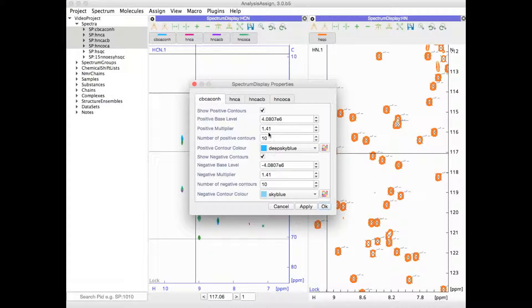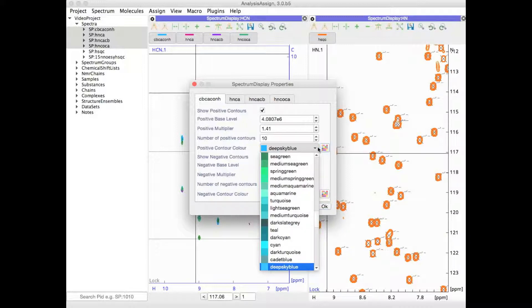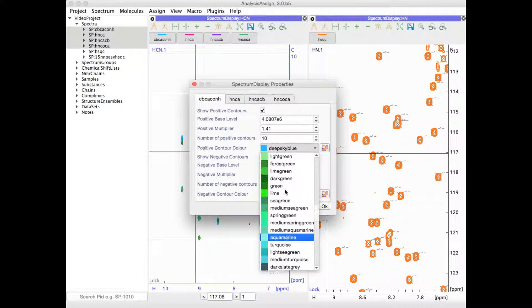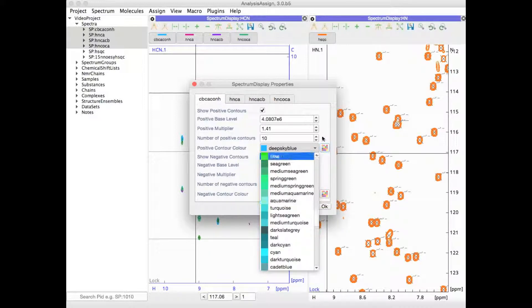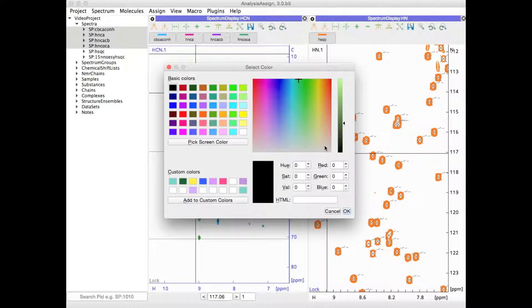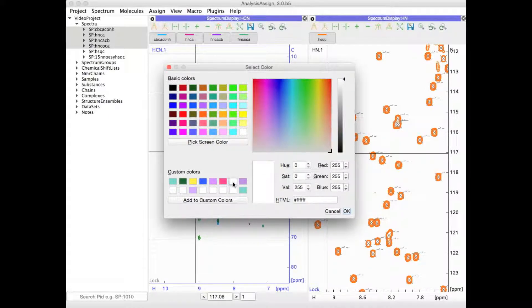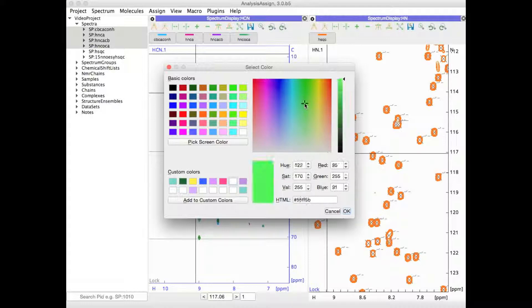You can also select whether to draw positive or negative contours or not. You can select from a whole range of different colors and also choose custom colors. Simply select a new box where you want to place your custom color, choose the color and add it in.